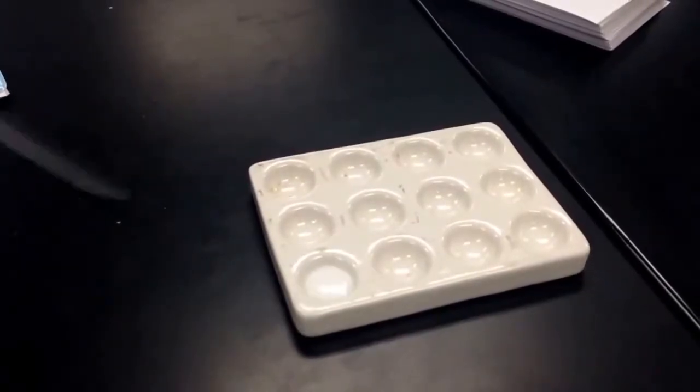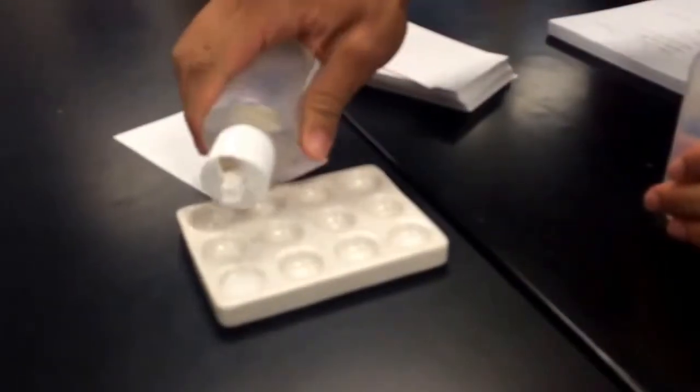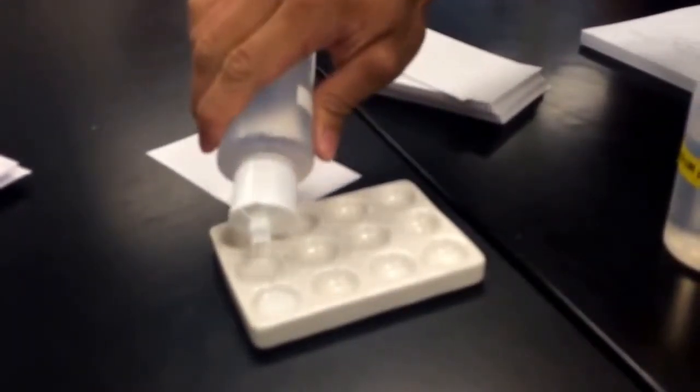Alright, silver nitrate and the sodium chloride is next. So we are now mixing silver nitrate and sodium chloride. So here goes the silver nitrate and the sodium chloride. And we also see white mist, however it is not as white as the first time with the barium chloride and sodium sulfate.